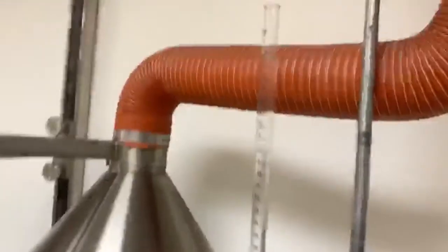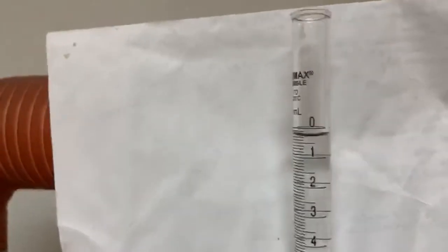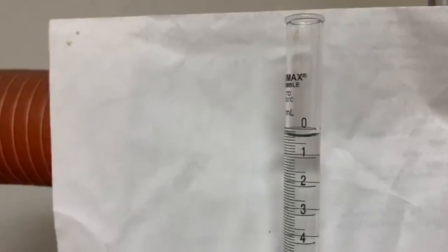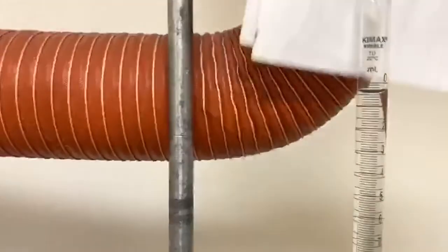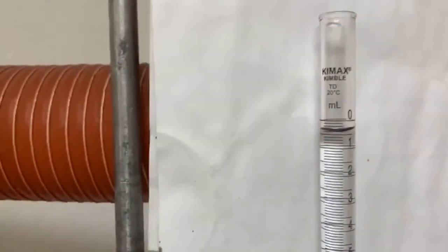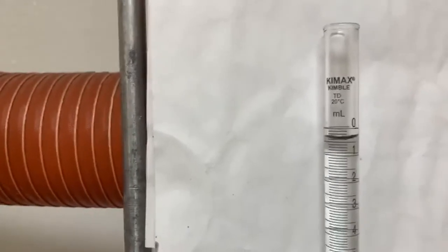In order to read it, sometimes you have to put a reference behind it. So for this titration on this side, you read at the bottom of the meniscus in the burette and take your reading of your initial volume for this particular burette. For the one on the right-hand side, again with our contrasting background at the bottom of the burette, you can indicate your initial volume for the burette.